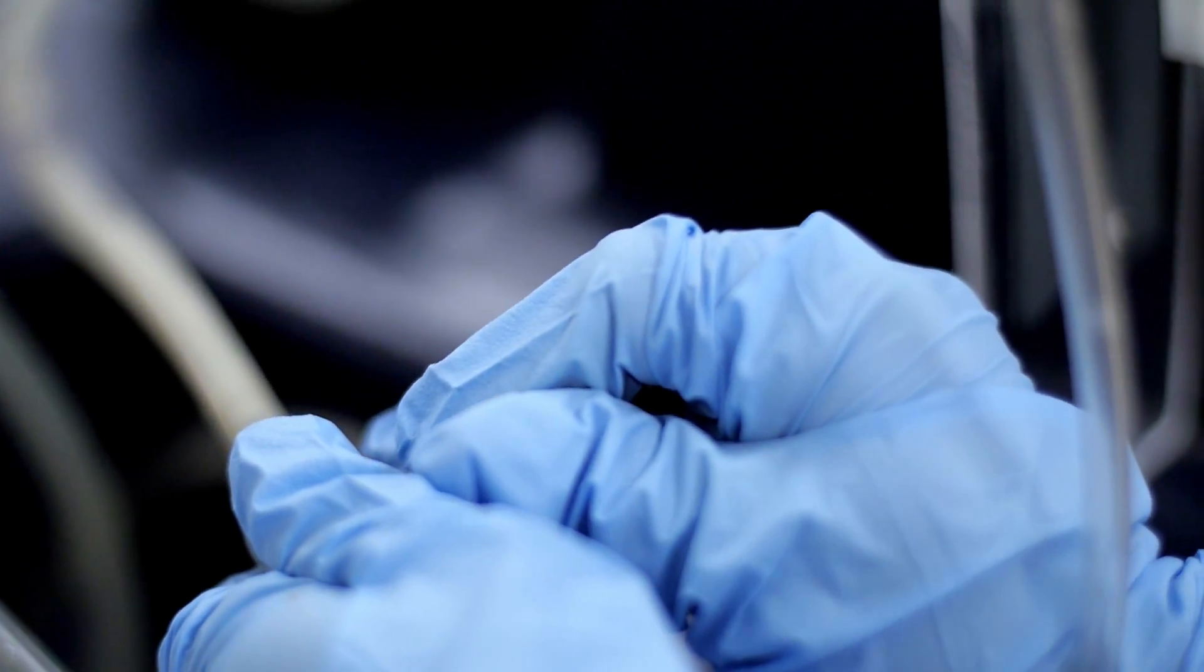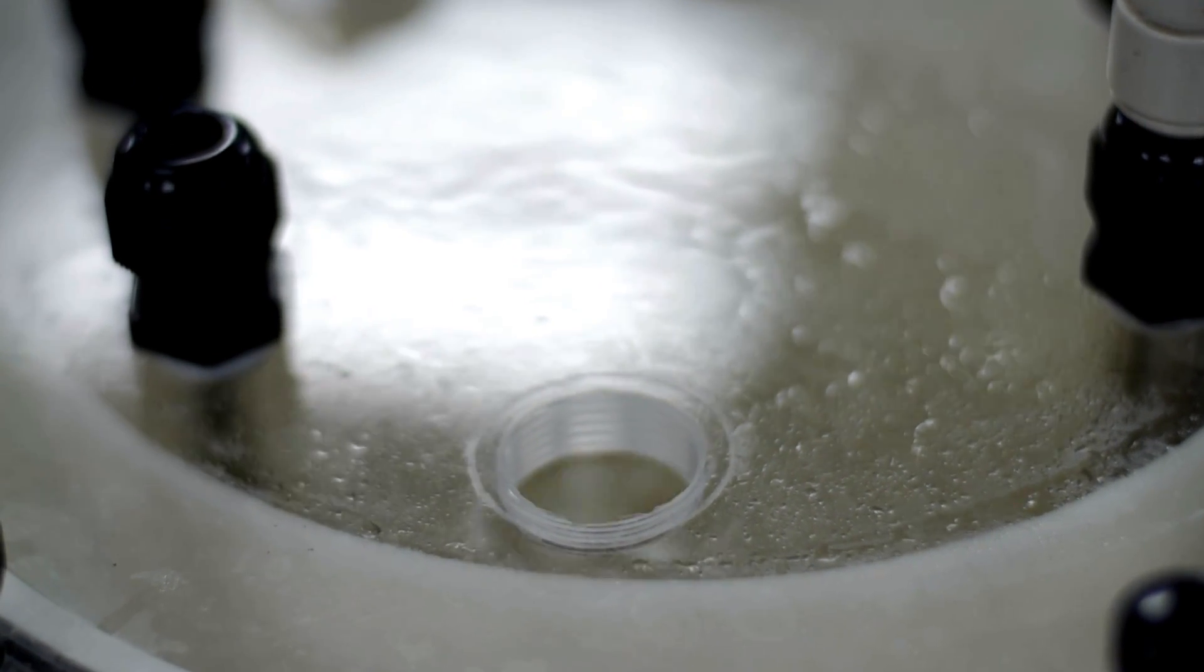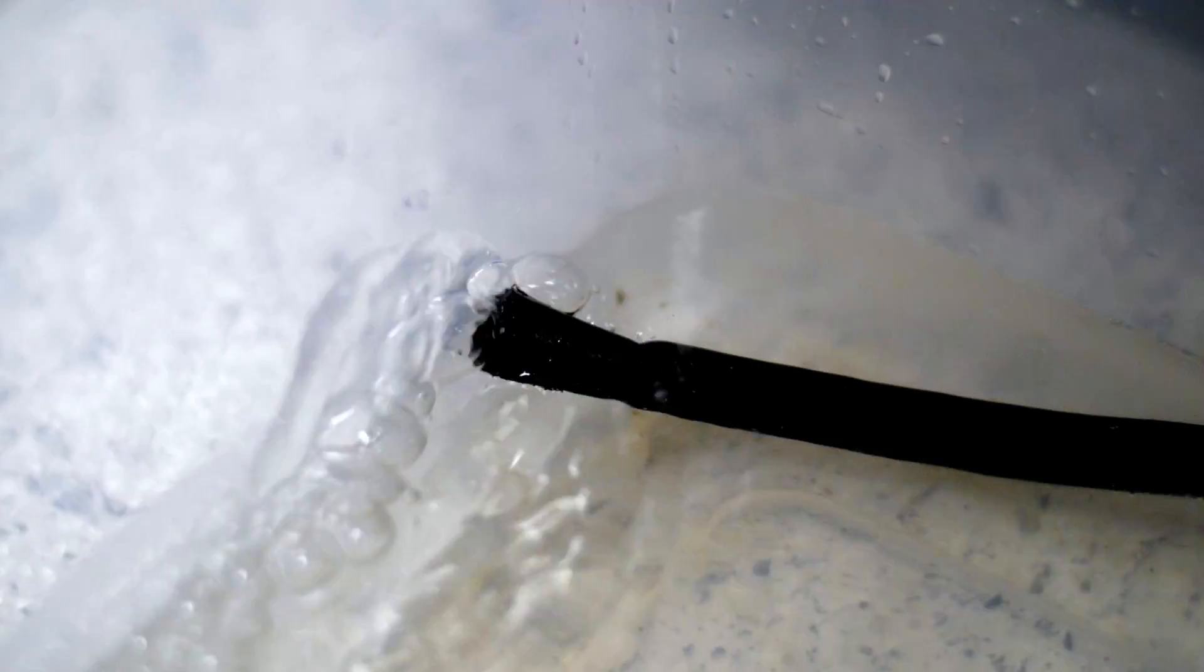The student places tubing in the feed tank and starts the pumps and bubbles air through the reactor. The oxygen allows microbes to break down the organic matter present in wastewater. The water then flows out of the reactor to another tank.